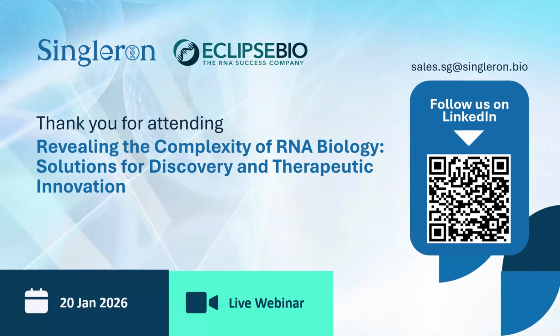Yeah, so I'd say it's a mixture between looking at just general ribosome association, that's also called translation efficiency in the literature. I'd say probably the little bit of majority is more focused on that, just seeing if you give a driven drug, does that change kind of the overall rate of translation? And the ribosome pausing typically tends to be a little bit more refined analysis, although we do see that very frequently in the IVT RNA space to look to see codon optimization. Is there a region that is potentially problematic, leading to a pause that could be optimized?